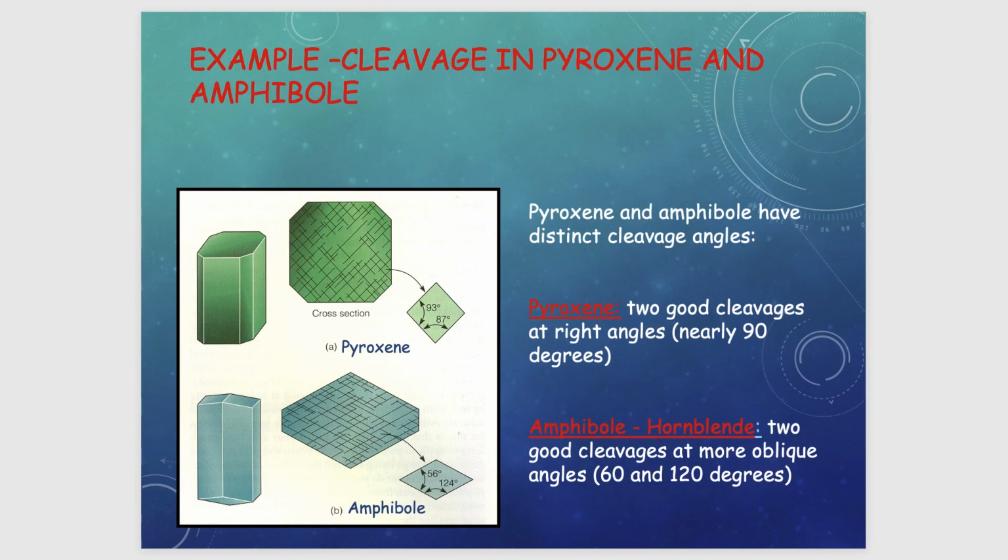The most important example probably for the classification of minerals is certainly in the evaluation of a pyroxene against an amphibole. So we were talking about the angle of cleavage. Quite often the classical cross section of a pyroxene will be fairly squared, and you will recognize inside the pyroxene diagonal patterns of cleavage. And so the bigger faces usually are at an acute angle with respect to the cleavage, which is important to learn. And these cleavages form a characteristic angle, so they form 93 and 87 degrees, so they are approximately at 90 degrees, and that's characteristic of pyroxene.